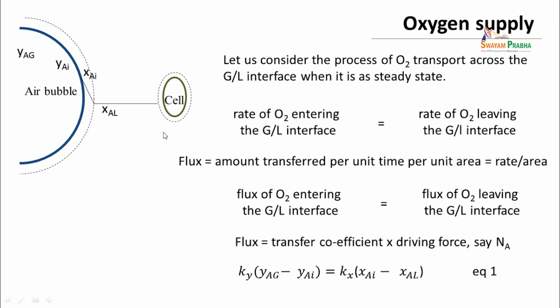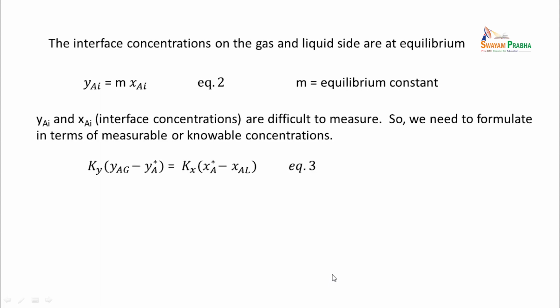So we represent the concentration here in terms of an equivalent gas phase concentration. The concentration in the liquid phase in terms of an equivalent gas phase concentration, and that is what YA star is all about. This is the concentration that is in equilibrium with the gas phase.